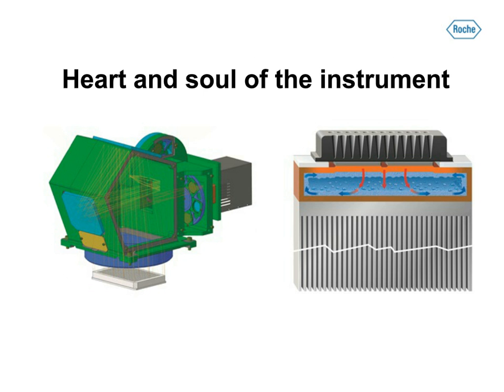In other words, if we have one reaction and split it up into two components and put one component in well A1 and the other component in P24 in a 384 format, and you run the reactions, then they are aligned together in a really tight fashion. The standard deviation between them should be something like 0.01 in terms of the alignment.